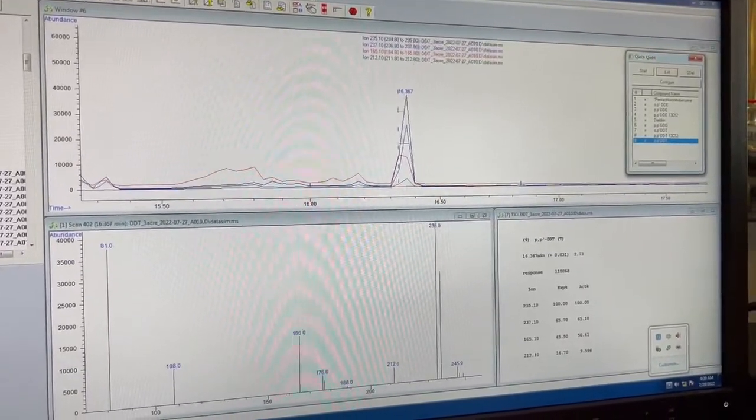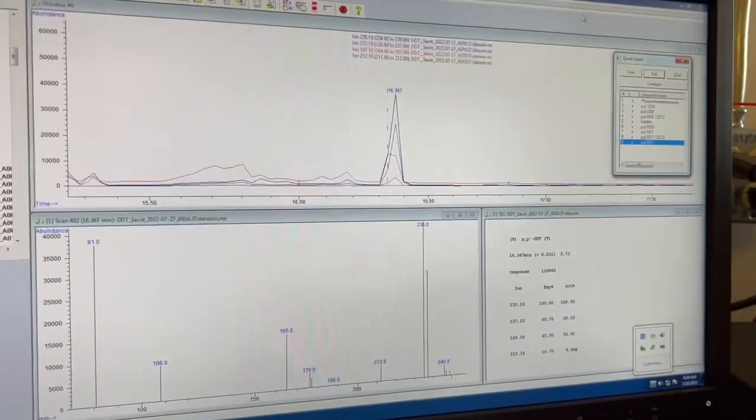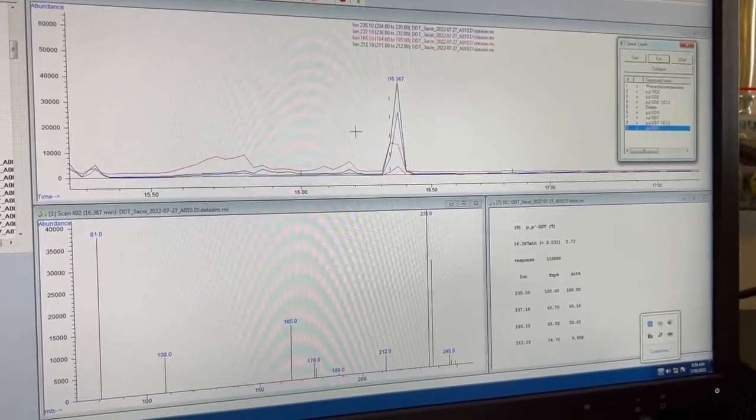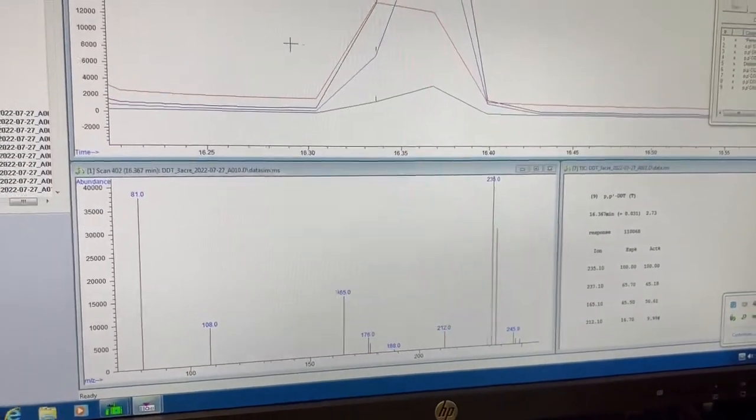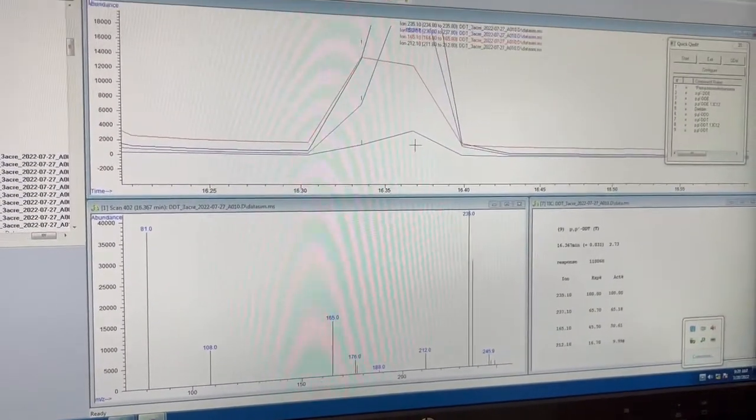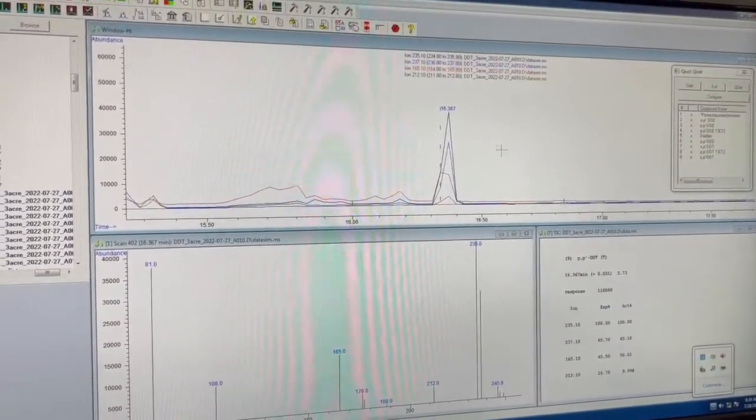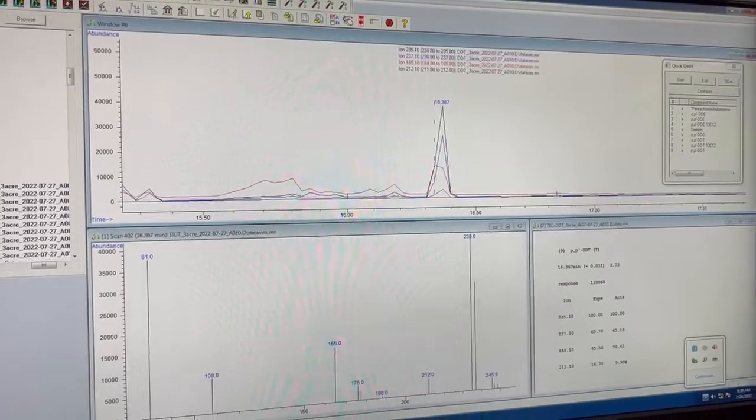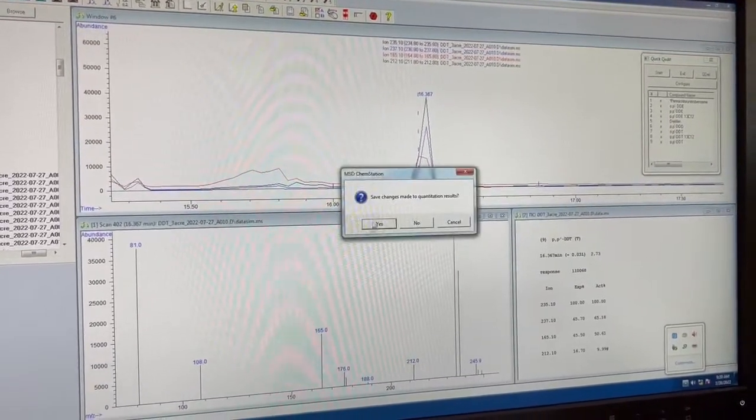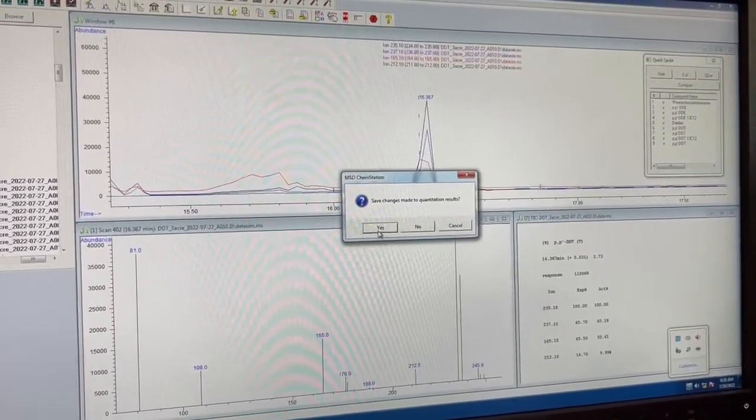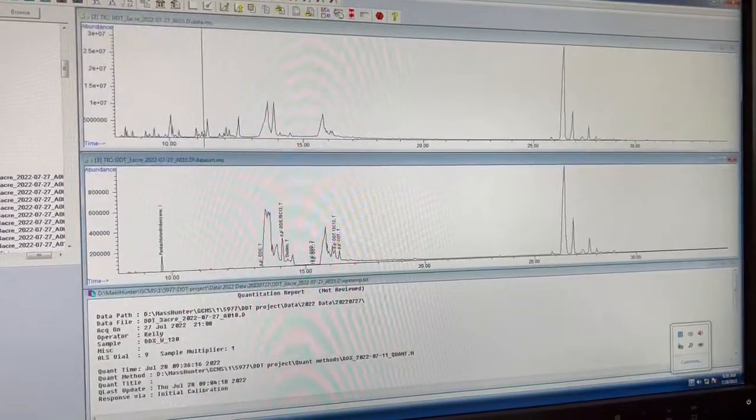Right. And then we have PPDDT. I think that looks pretty good. And again, if you're ever not sure, you can just zoom in by scrolling in. So that looks good to me. And so we just exit, save.